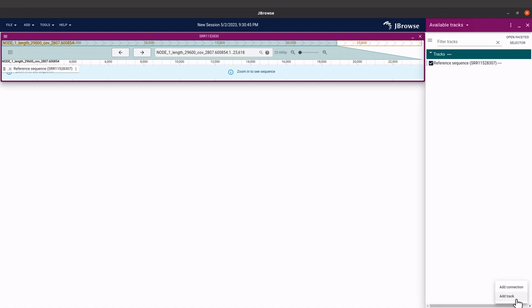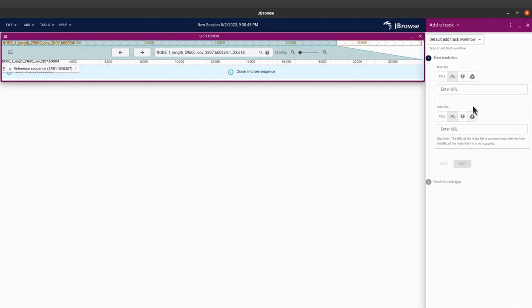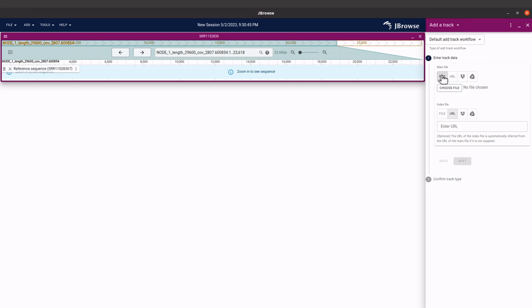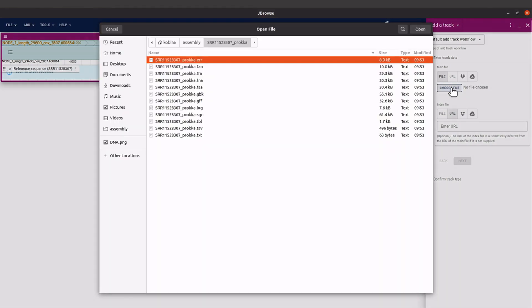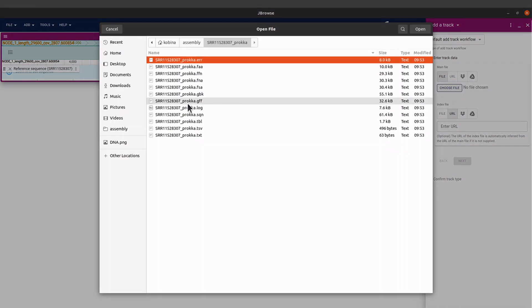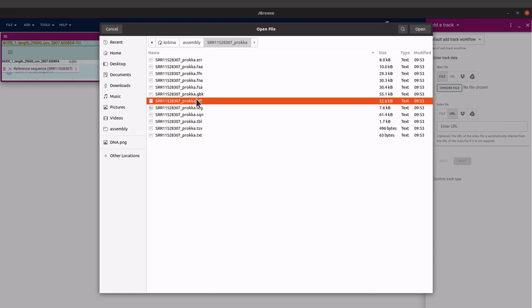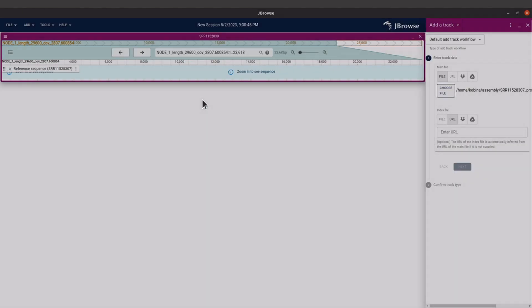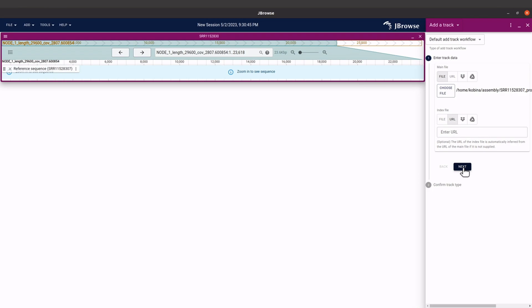Select 'Add Track'. Once you do that, make sure you click on 'File' first because we are going to use the file. Then click on 'Choose File' and select your GFF file — the dot GFF file. Open it and then go to 'Next'.